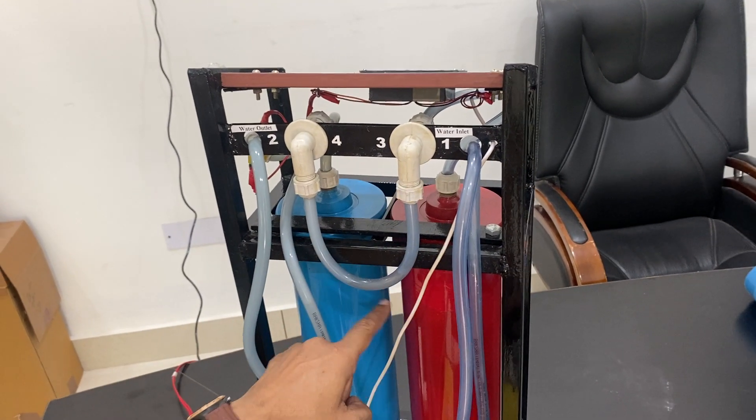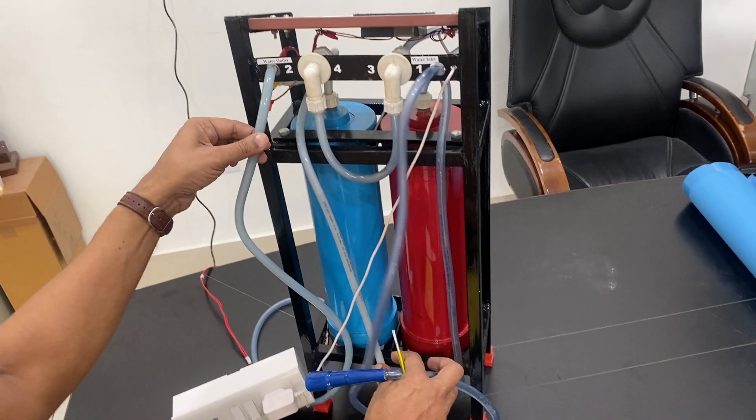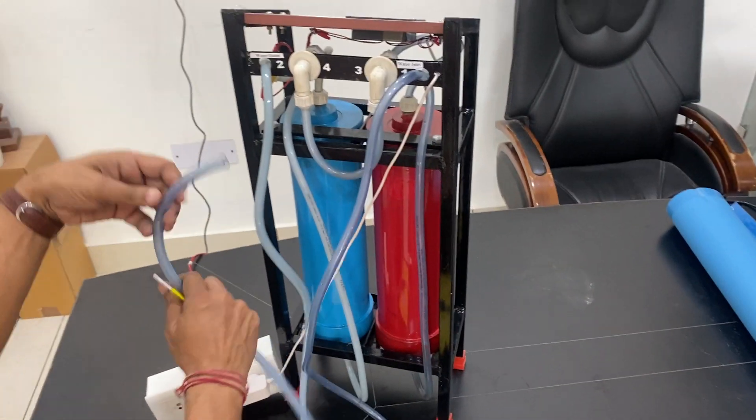The inlet water, after crossing from one chamber, goes to the other and then comes out from the top. The whole output — the deionized water — will come out from there.